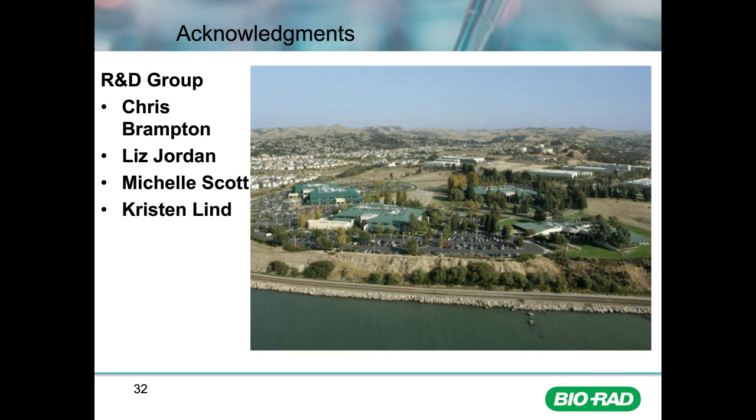I would, if possible, generally do the analysis directly after thawing. But there are definitely reasons for waiting for stimulation or for recovery overnight. To make sure that we have the most representative sample of what was frozen down, I would use it directly.